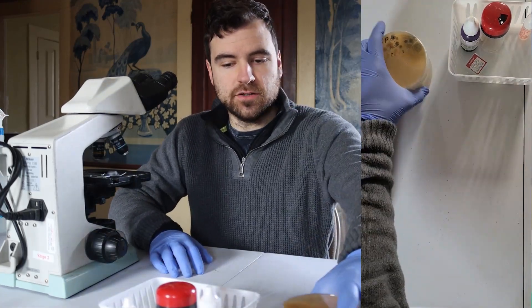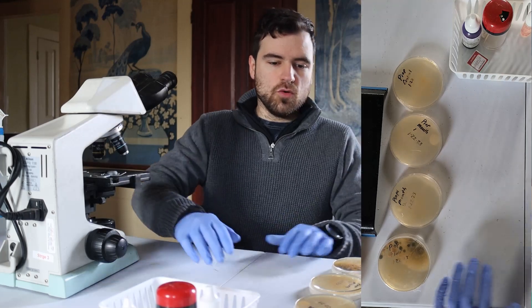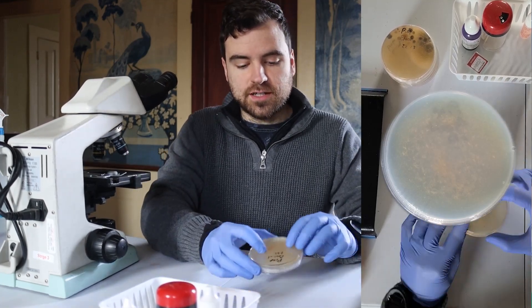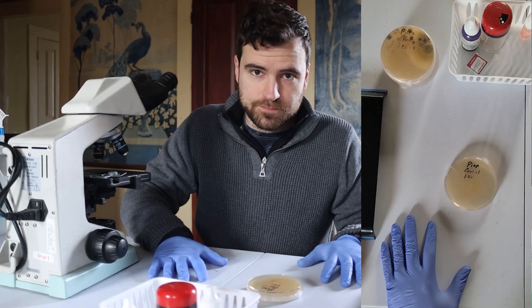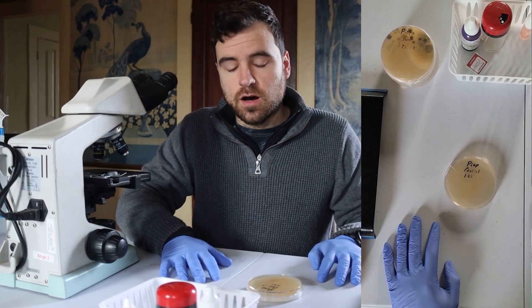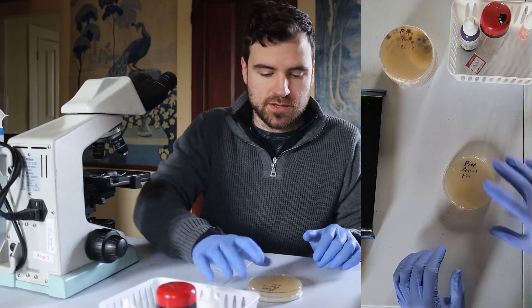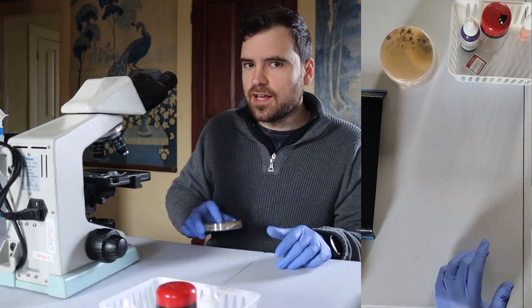In front of me here I have our four plates. Let's go over the control first. As you can see, we've got no growth. So that means we can say with pretty good certainty that the P.O.P. Ni culture is dead — there's nothing there. That is a little bit of unfortunate news, but there's still a takeaway here.